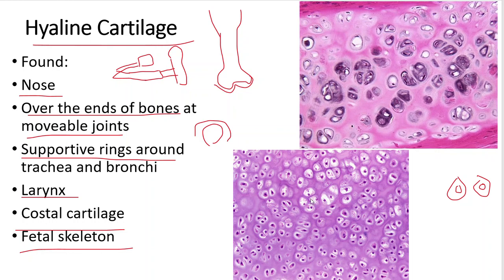Whatever helps you. Those are the nuclei of the chondrocytes. These are the mature cells. The chondroblasts are the cells that are still making this ground substance. Well, they actually do the fibers and then some of the rest, proteoglycans and so forth. What they're sitting in is like a little shallow bowl-like depression, and that's called a lacuna. You're going to see those again in the bone here in just a minute.